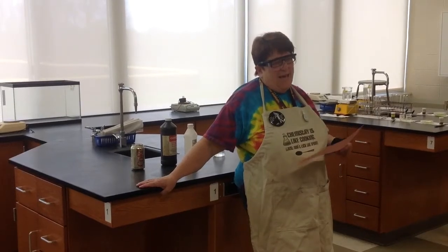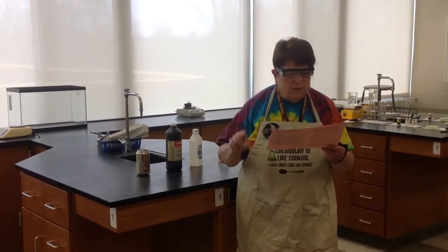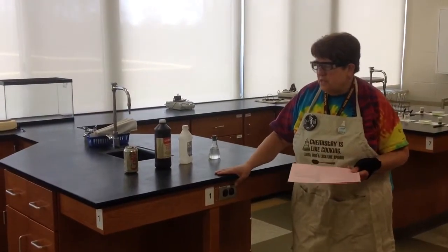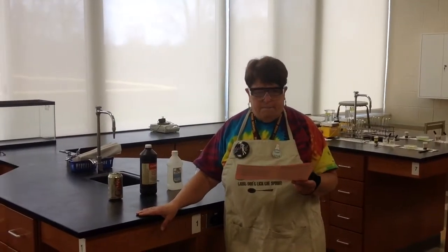This lab is on solutions, ladies, and you have a variety of stations to get to, so be efficient. Anything marked with an asterisk, you can do later. Station 1, very simply, you're looking for the solutes and the solvents in here. Just write down what you see on the labels and read the directions. If there's more than one solute, list all of them.